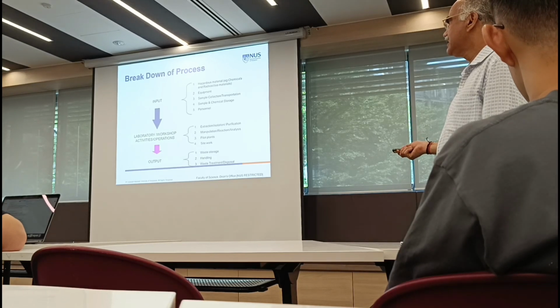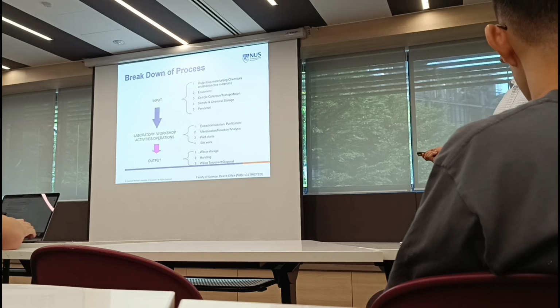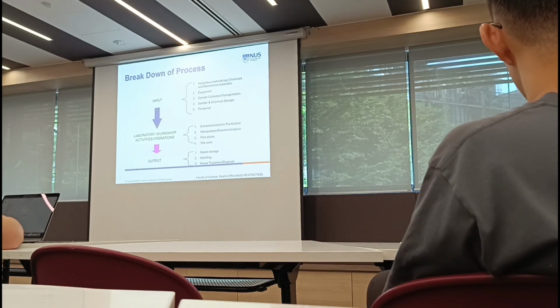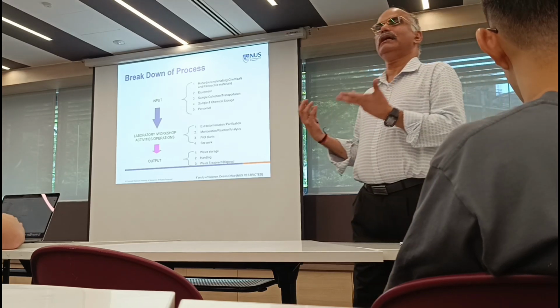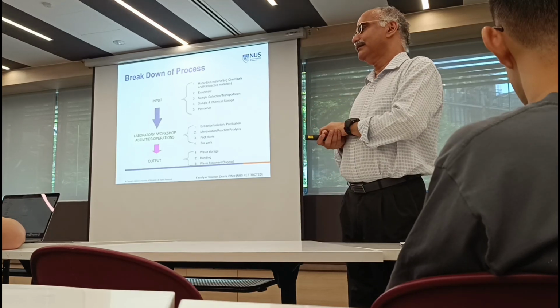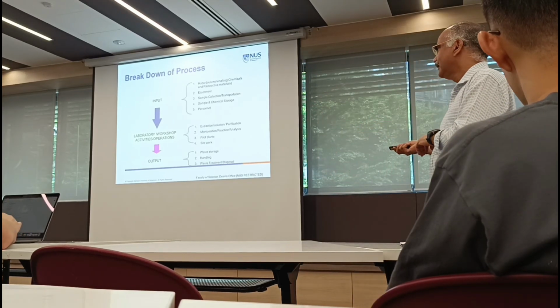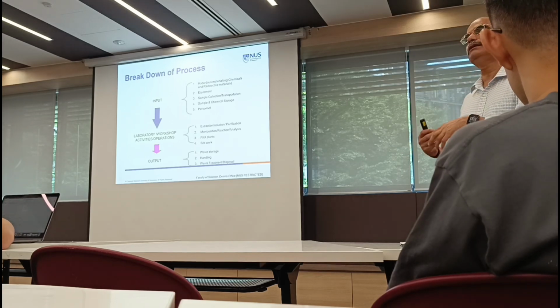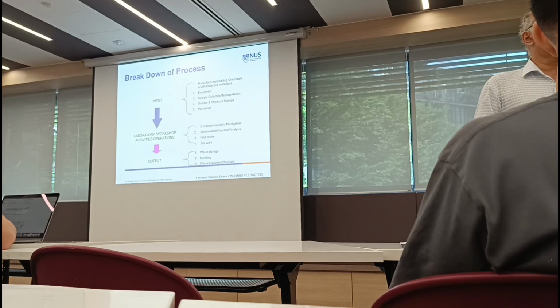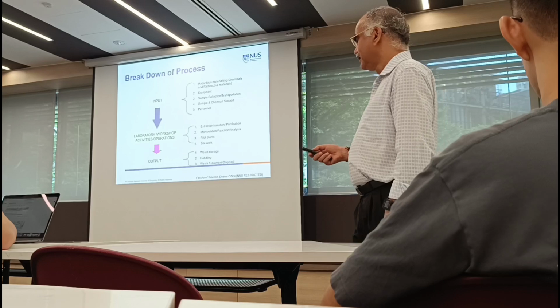And then for the procedure, it's usually extraction, isolation, purification, manipulation, reaction, analysis, etc. Pilot plants, and then site work. Pilot plants and site work don't apply because you're not doing that kind of large scale. Sometimes, you know, you probably scale up into a system, but this is relatively rare. Yeah, and then output is usually your product, waste storage, handling, and waste treatment and disposal. Because every reaction you do, you will have some solvent waste, some other waste as well. So you need to know how to dispose.